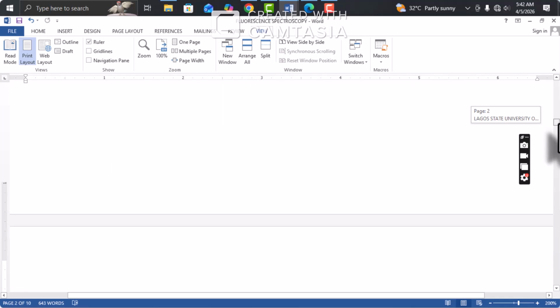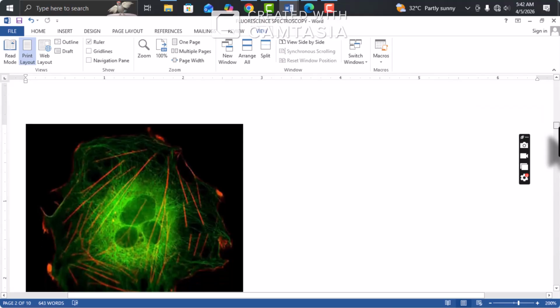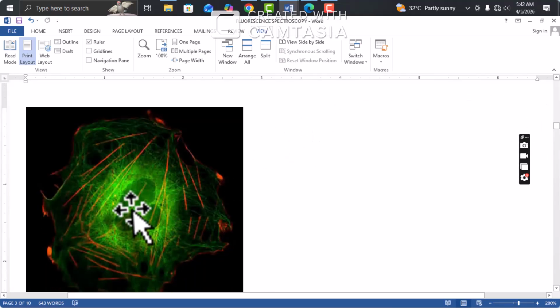Now, look at another important tool. Fluorescence is also used for imaging cells. This cell does not look like this under normal light, of course, but sometimes to see the content of the cell, a fluorescent chemical can be introduced into the cell, and the cell is placed under the UV light to produce a green glow.